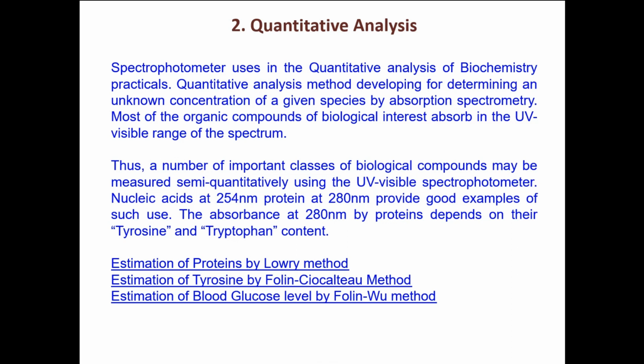So lactate dehydrogenase is there. Dehydrogenase is an enzyme which converts lactate, in reaction with NAD plus, to give pyruvate and NADH plus H plus, right? So this is the reaction. Then what should I take? I have two substrate molecules here: lactate and the NAD plus cofactor. Pyruvate is the product, and the byproduct is NADH plus H plus, or you can say a cofactor again.